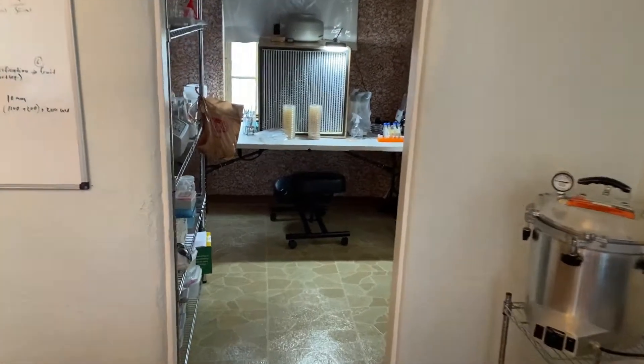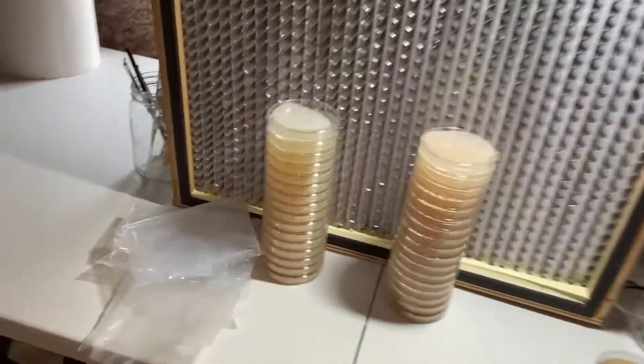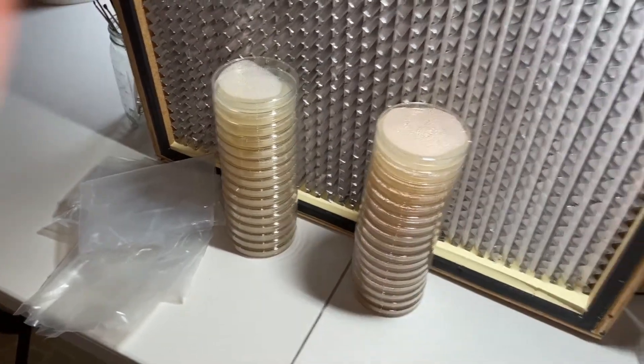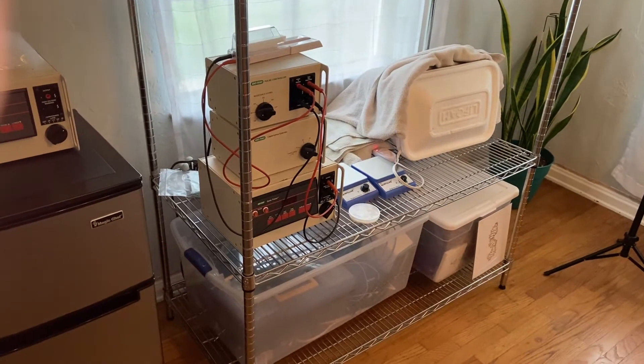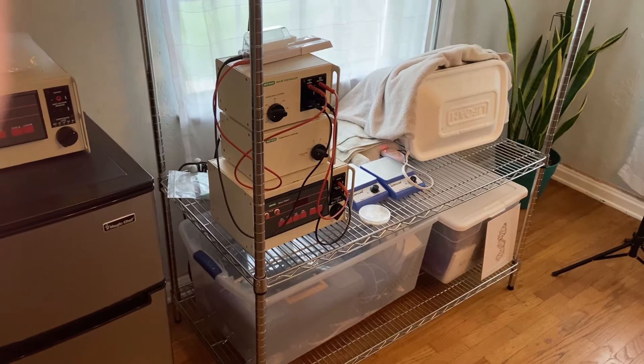Hopefully those cells will recover. Once that has done its thing, we'll pull out a plate and streak it. One of the plates that I made yesterday, which we can come and check on now — I need to bag them up, they've kind of been sitting here. These are the MEAs and those are the LVs. And yeah, we'll see if that 15-week-old stab of E. coli is able to be revived back to life.